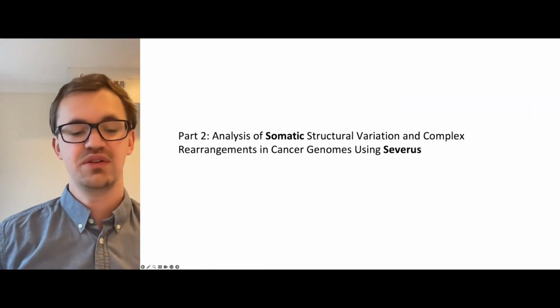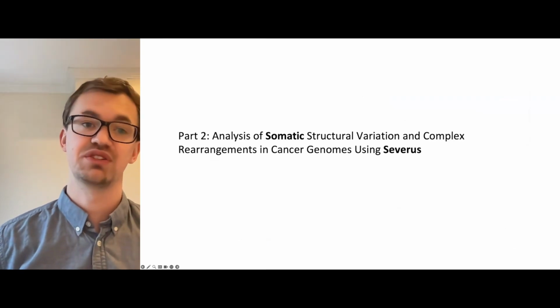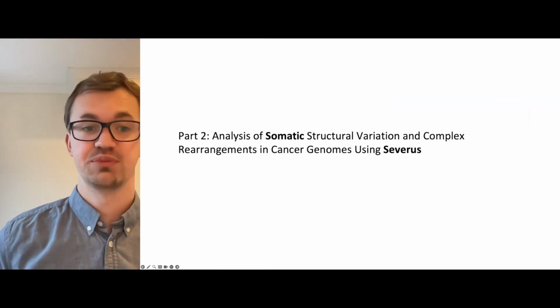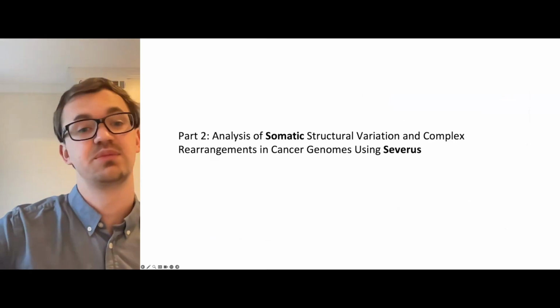So now we'll move to the second part of the talk, and I will be talking about somatic structural variation analysis in cancer genomes. And I will talk about the tool called Severus that we have developed.